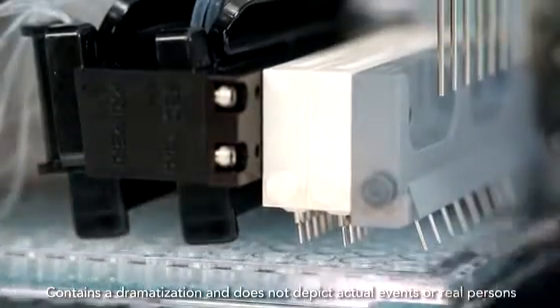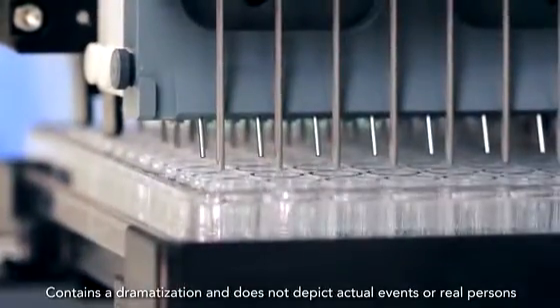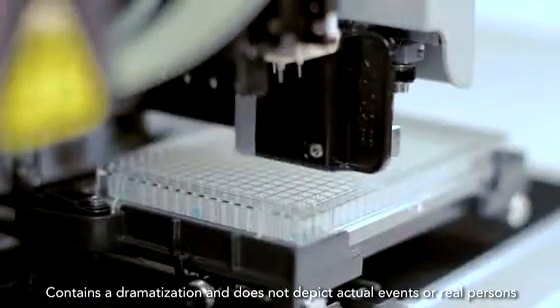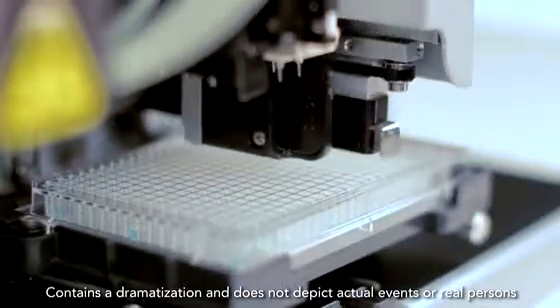The angled dispense tubes give us much better results with our cell-based assays, and there's a single channel dispense option called RAD that will be great for dispensing very small volumes, saving us even more money.